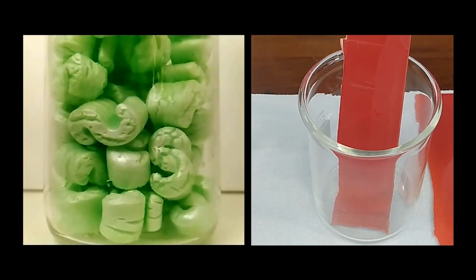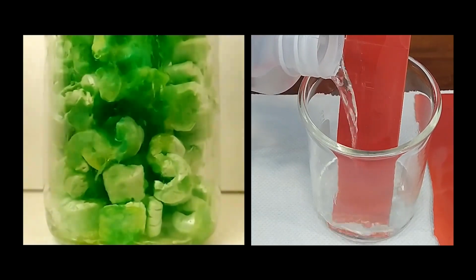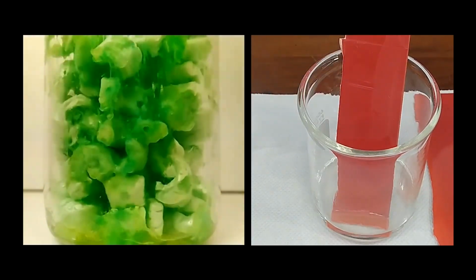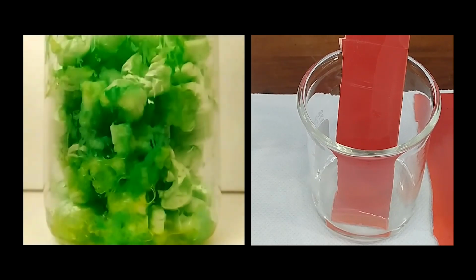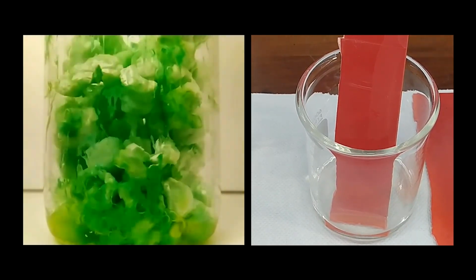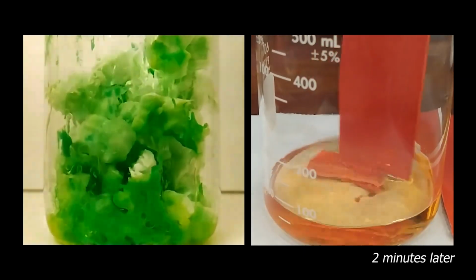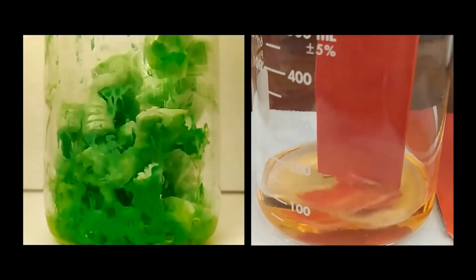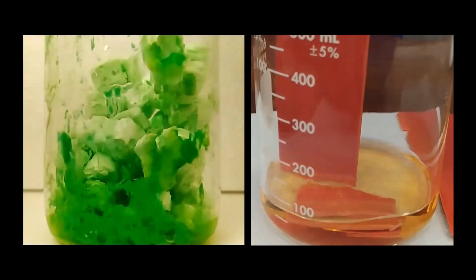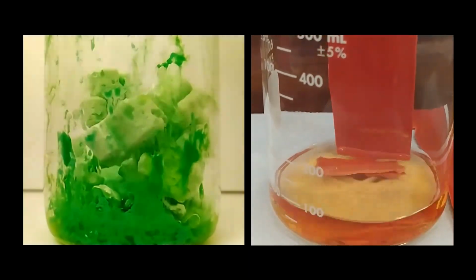Perhaps it's easier to see what's happening if we take some of those packaging pieces and compare that to our non-expanded polystyrene sheet that we talked about earlier with regard to masks. You can see the rapid dispersal of the air on the left and those bubbles forming. On the right, the sheet softens over time and the dye leaks into the solvent. It's much less dramatic, of course. If we left both for longer, we would end up with a polymer sludge at the bottom of each beaker.